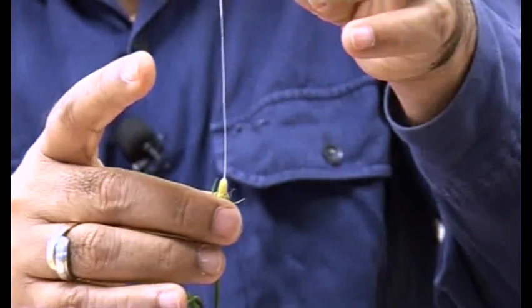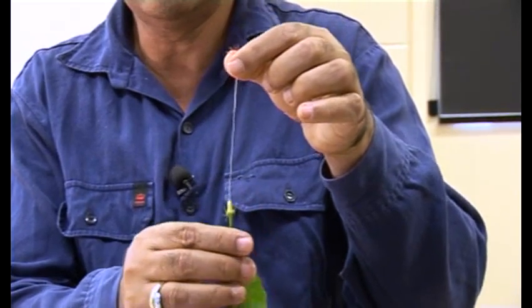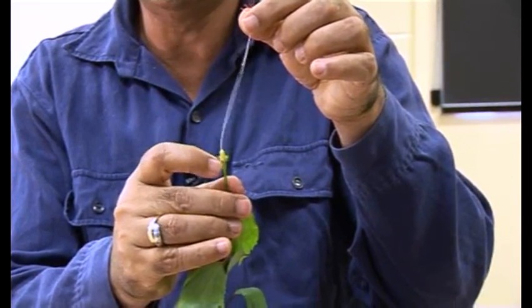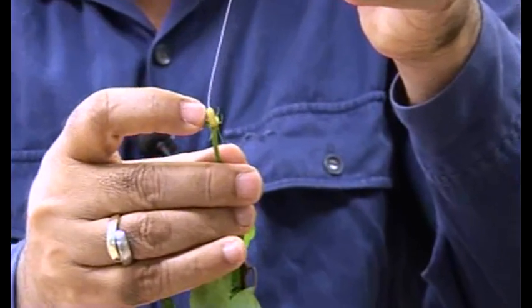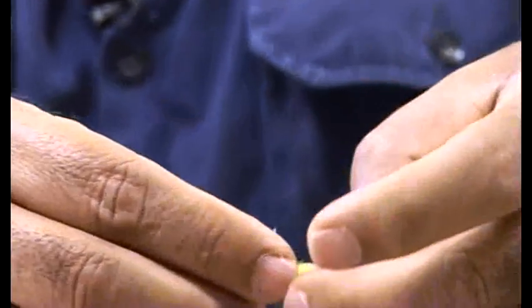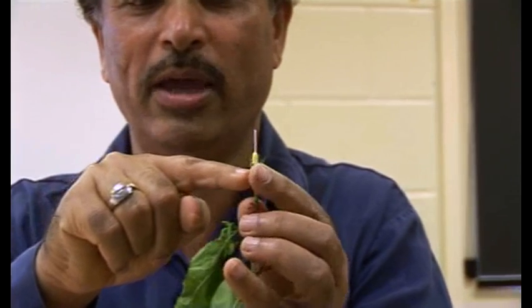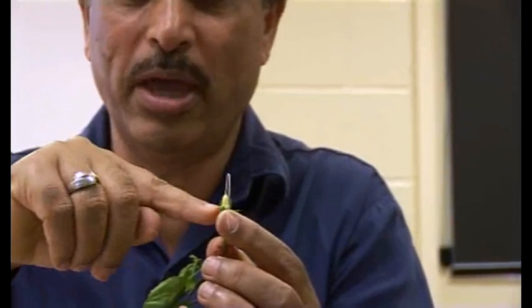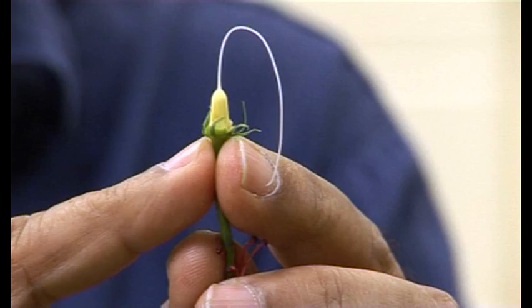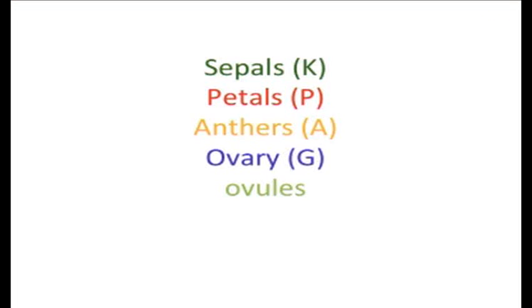So now we have the four parts: five sepals, five petals, more than 10 anthers, and the ovary. You need to determine if the ovary is superior or inferior. If the ovary is sitting above the junction at the base — the receptacle — it is a superior ovary. If it is buried underneath, that is known as an inferior ovary.